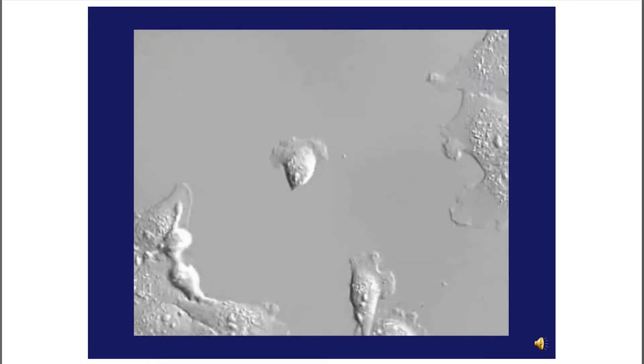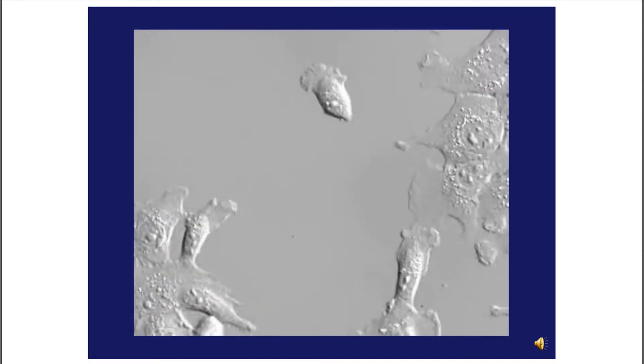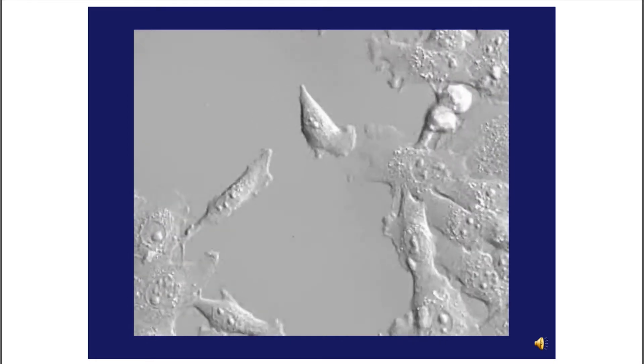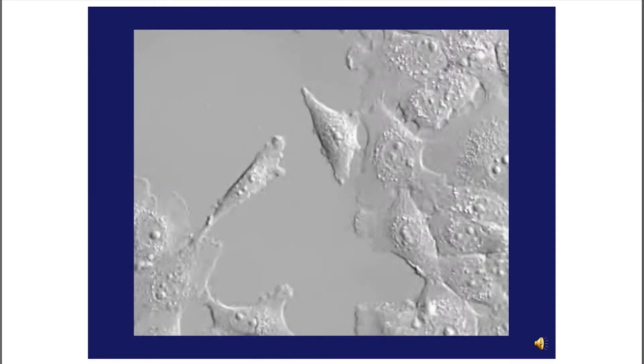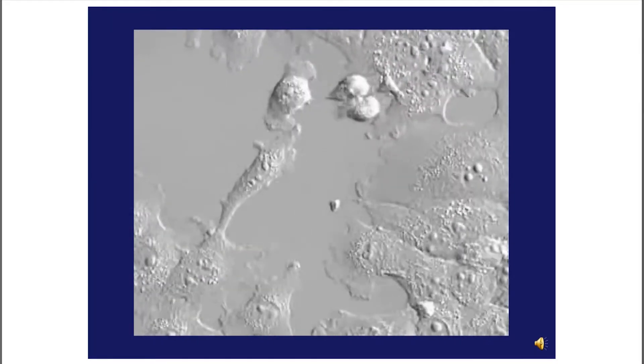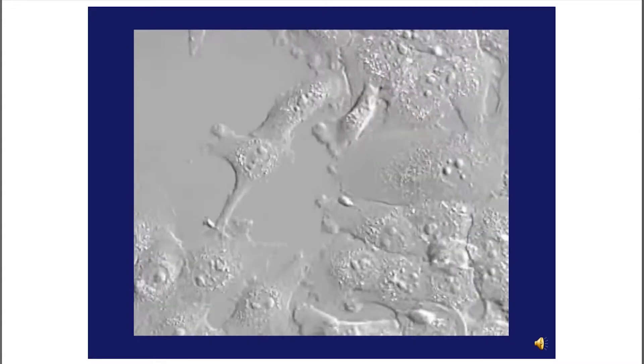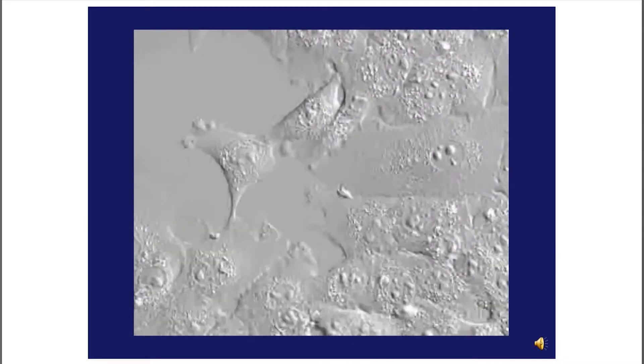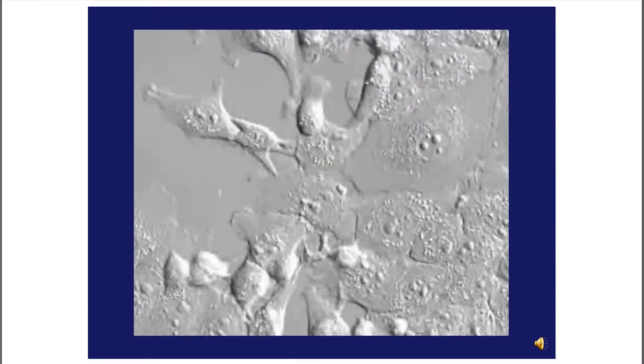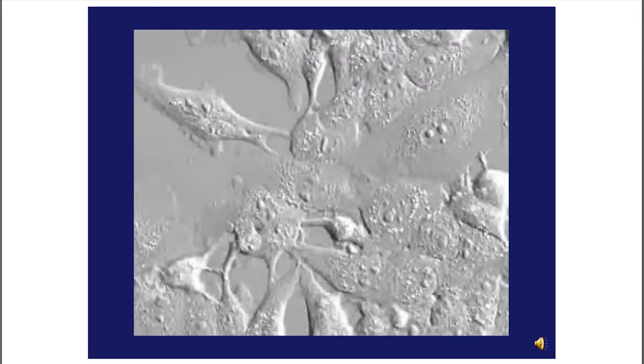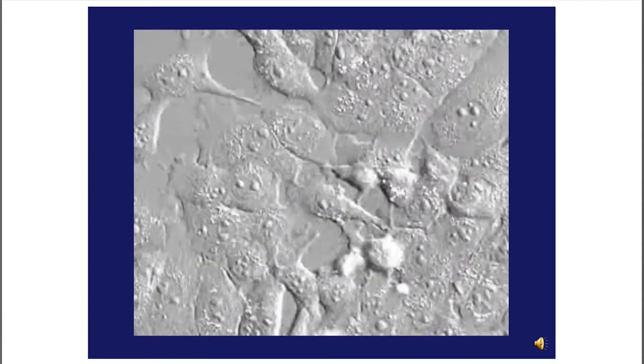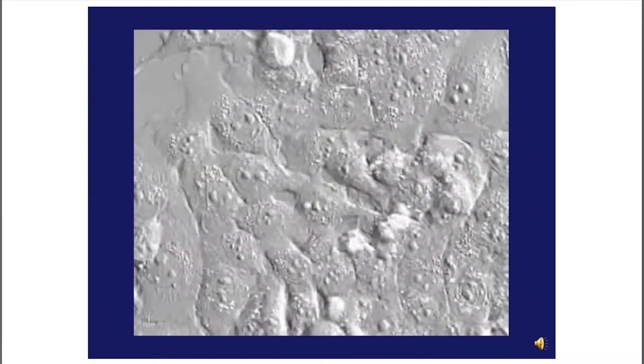In this slide, we're going to look at some time-lapse video of epithelial cells as they're growing in tissue culture. Imagine for a moment that instead of having these cells growing upon a glass or plastic substrate, instead they were growing upon a gold electrode, and this electrode is carrying a very weak AC current. As the cells with their oily insulating membranes coat this gold substrate, we should be able to detect a change in the electrical properties or the impedance of the electrode due to the presence of the cells. In this manner, we could electrically monitor the activities of the cells instead of relying on optics, as in this fascinating look at cell behavior.